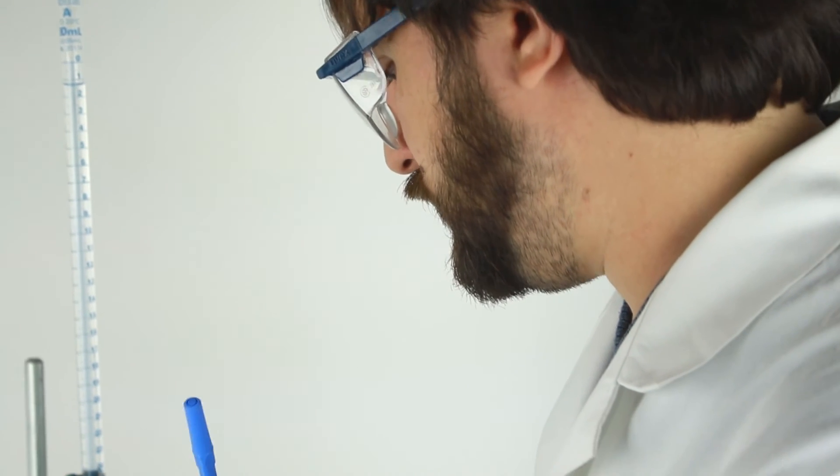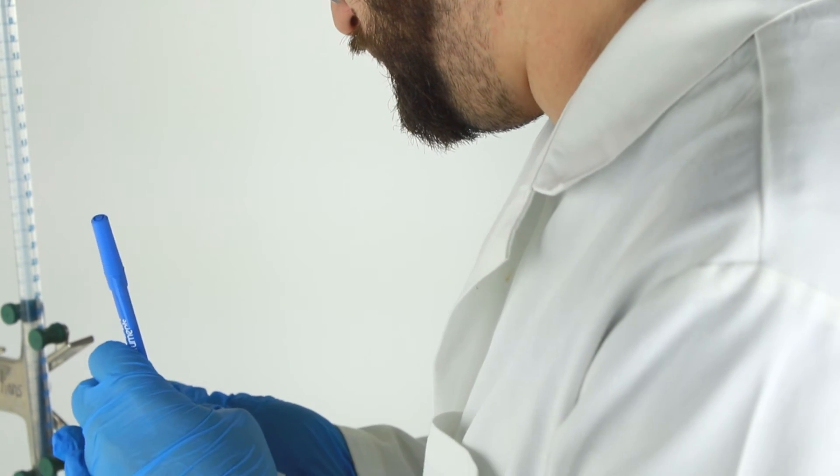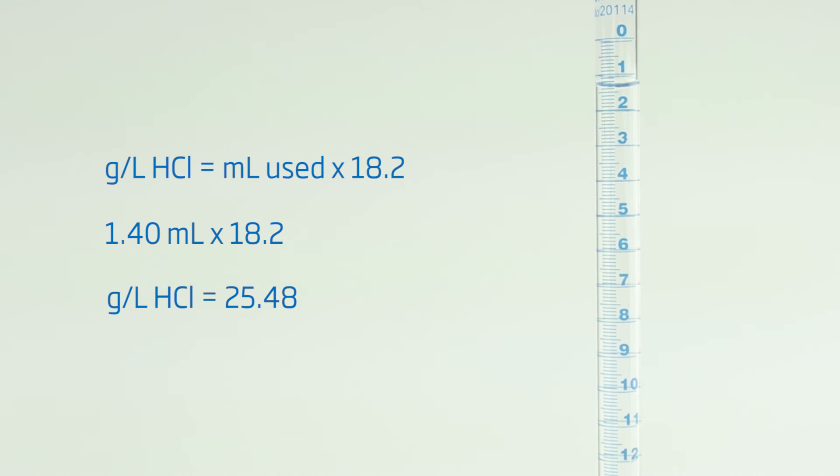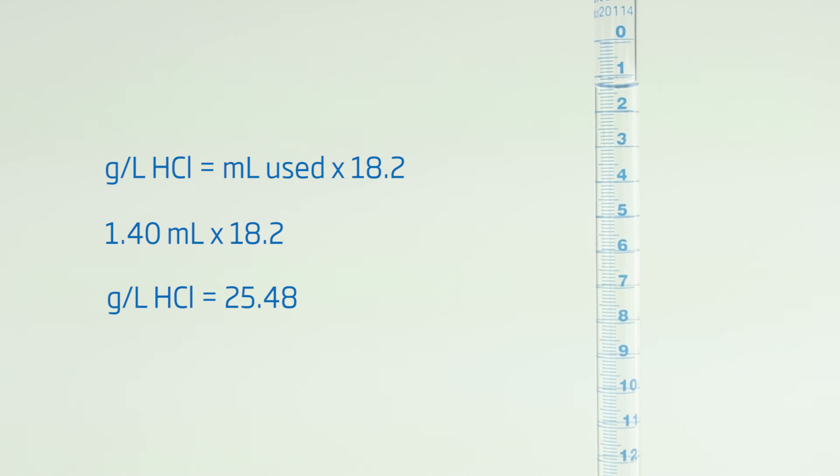Now, we'll determine how much titrant we used and perform the calculation. Reading the meniscus, we can determine exactly how much titrant we used by comparing the amount of titrant in the burette before and after titration. We used 1.4 milliliters of titrant. To calculate acidity as grams per liter of hydrochloric acid, multiply the milliliters used by 18.2.